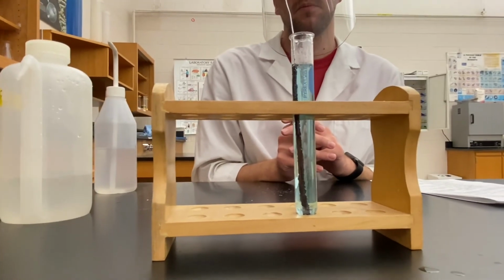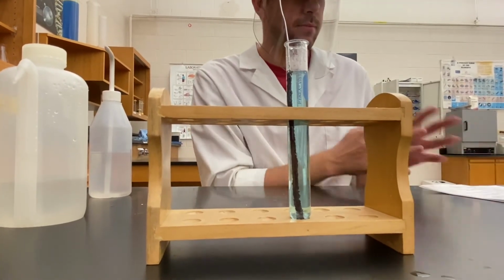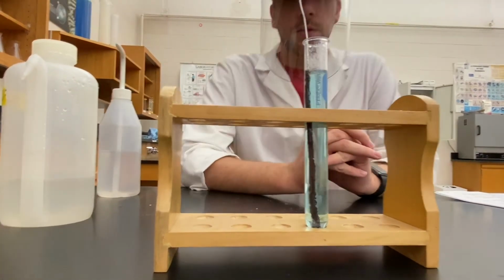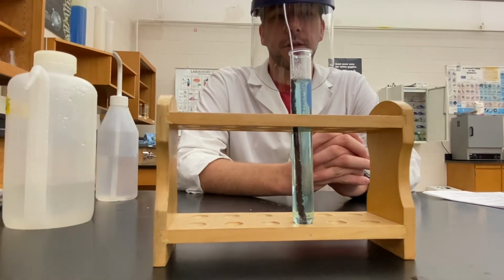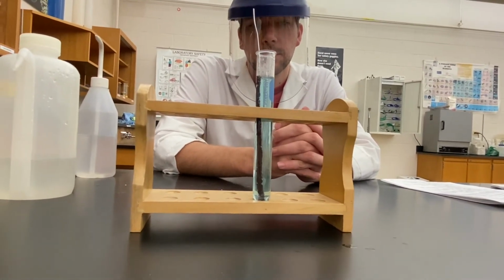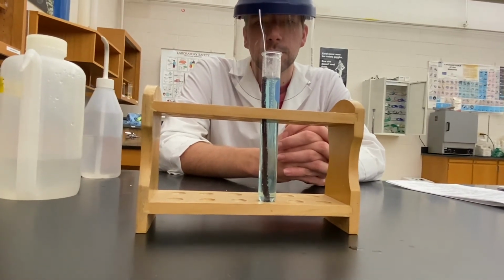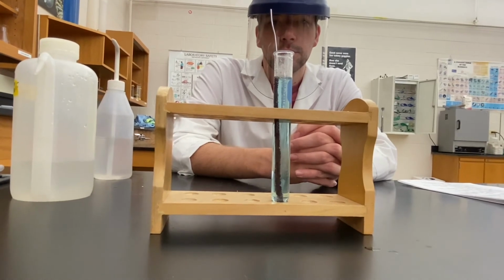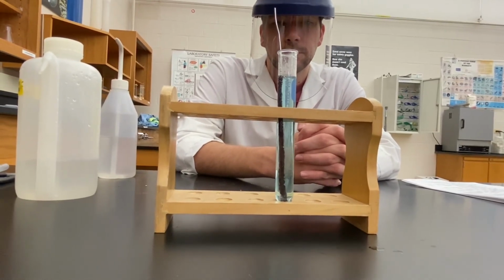Watch the color of that blue solution to see what's happening to the intensity of the color. Good note, Mrs. Barron, thank you. Is it fading? Is it becoming lighter? Is it getting darker? Also note that you have the hydrogen gas bubbles forming. I don't know if Mr. Huser mentioned that.